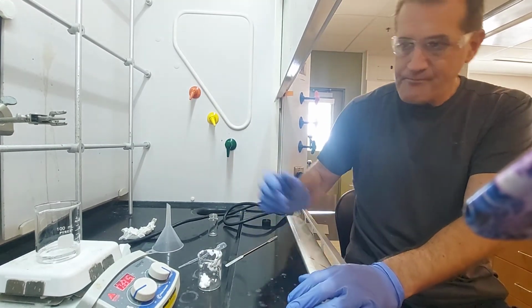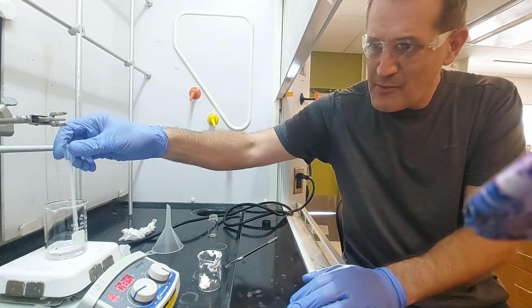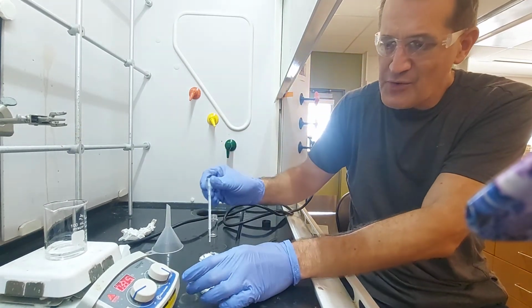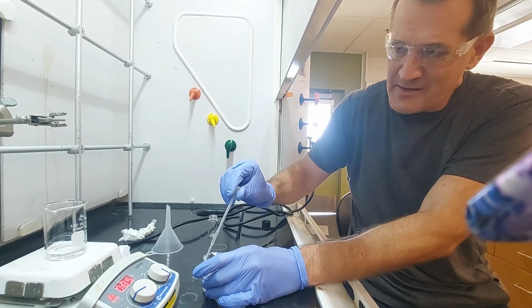All right? So here's what I'm going to do. I'm going to take some of my hot ethanol and I'm going to squirt it. Actually, I'm going to squirt it around the sides here to try and get everything down.